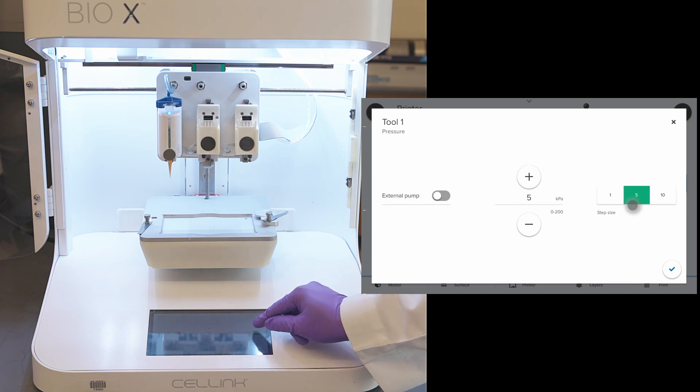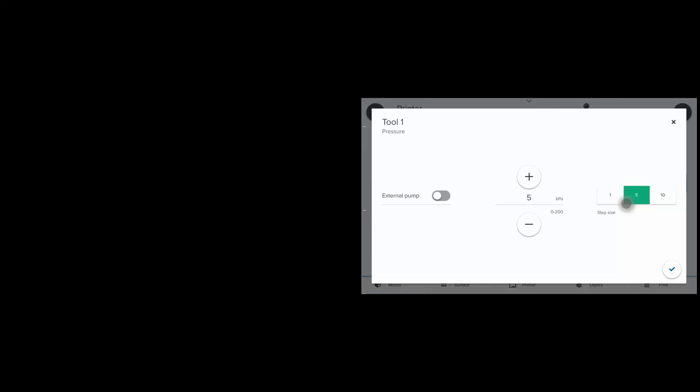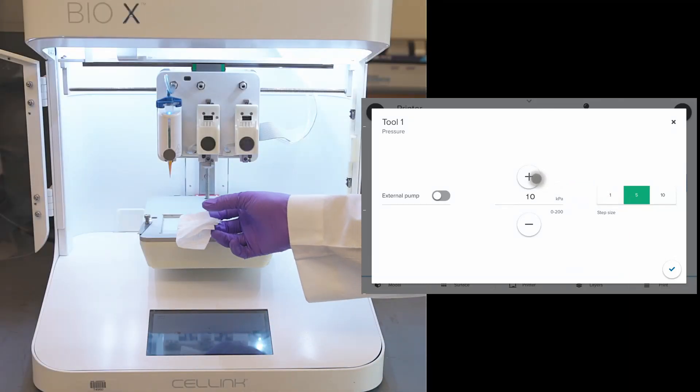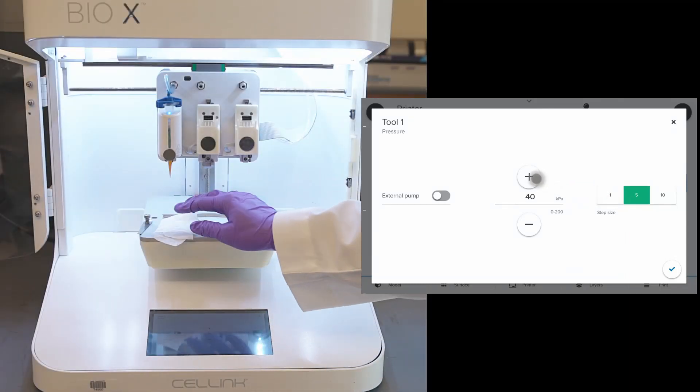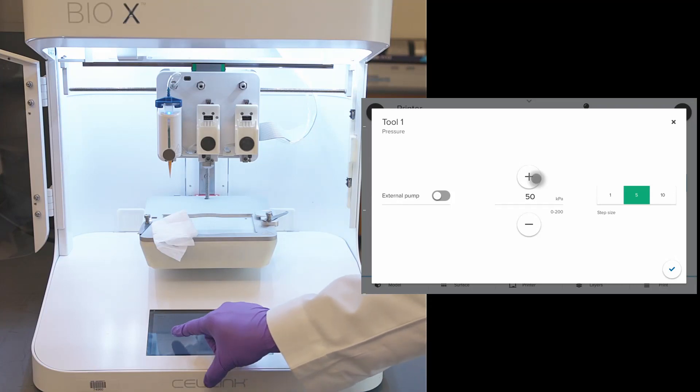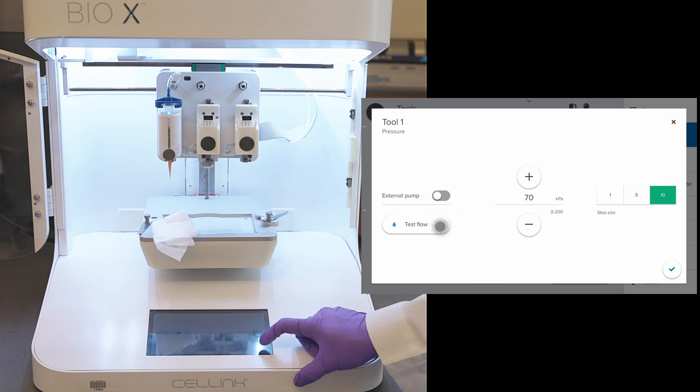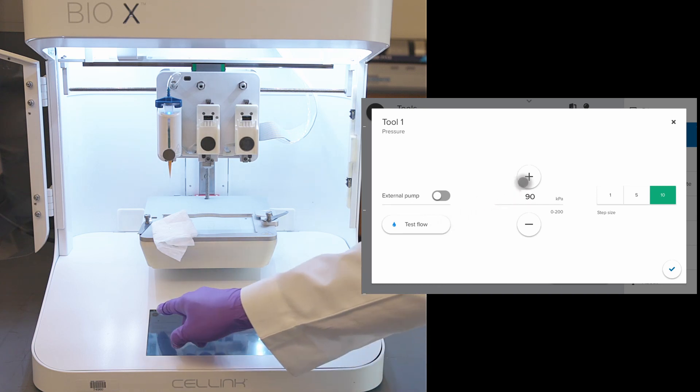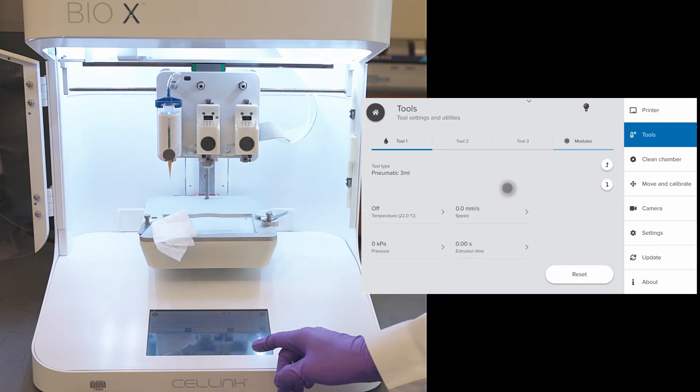Here, we can choose different step sizes. Place a piece of Kimwipe to collect extruded material. Adjust the pressure and click test flow. We may have to try different pressures until we see uniform fiber being extruded. As 50 kPa is not extruding a uniform fiber, I am going to increase the pressure to 100 kPa. Once we see optimal extrusion, click OK.